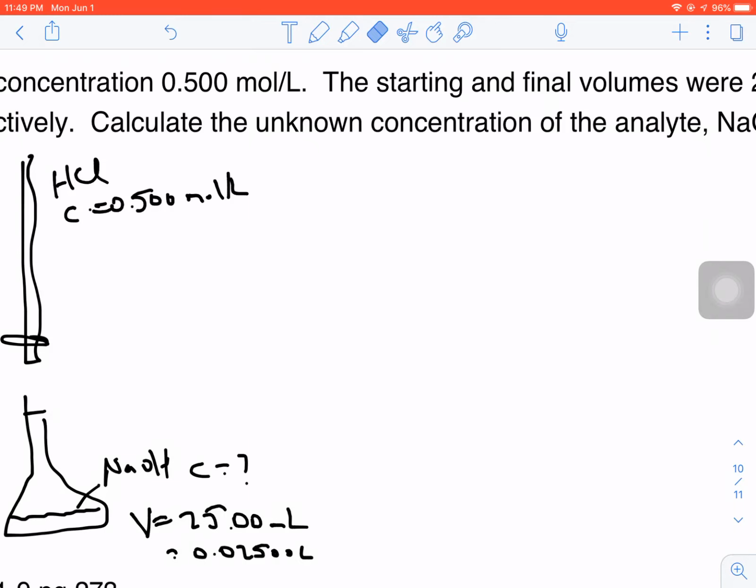All right, and now I'm going to look at my formula and start the math. So I'm going to have a reaction between HCl and NaOH. Notice in this case that the NaOH, if I put phenolphthalein in here, is going to turn pink right away. And as I add HCl, I'm going to keep adding HCl until the pink goes away.